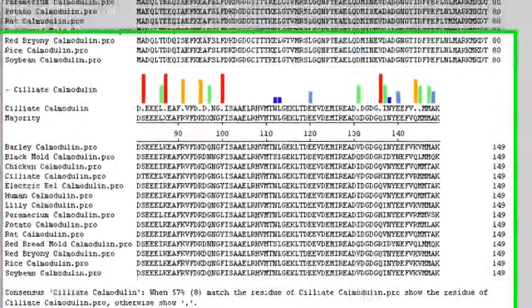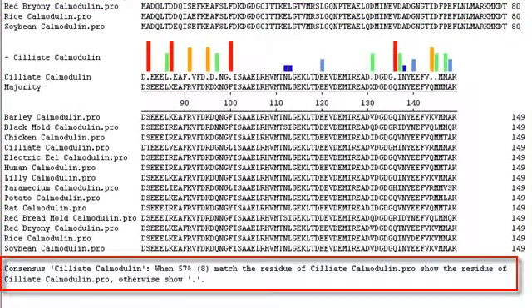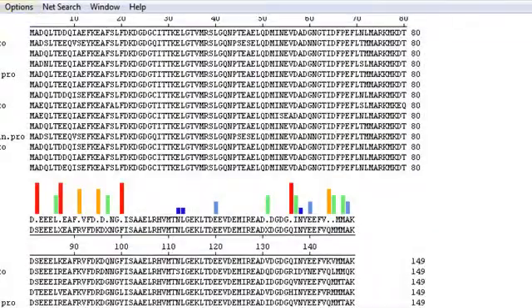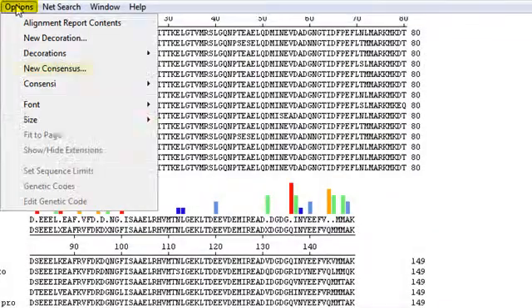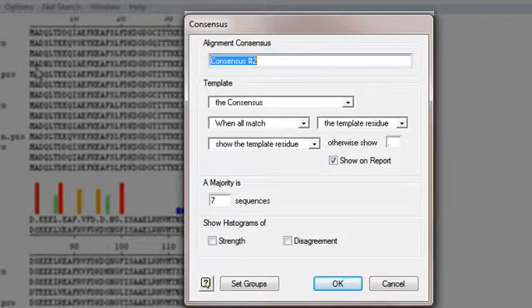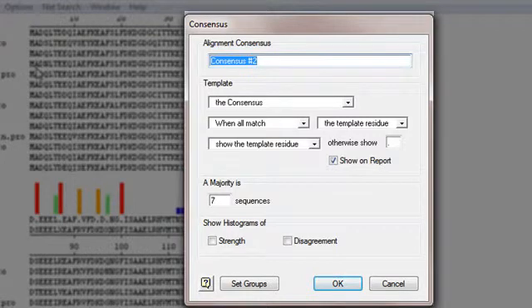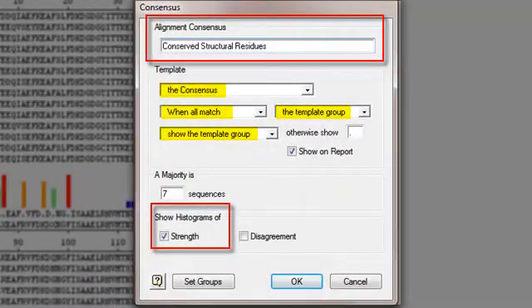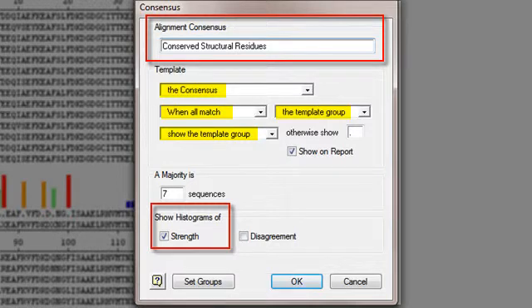The bottom of the alignment report shows a description of the consensus that I just created. I'll use the options, new consensus command again, because I'd like to see where all species show conservation of structural residues. This time I want to highlight places where all species share residues within the same template group. These are my final settings.